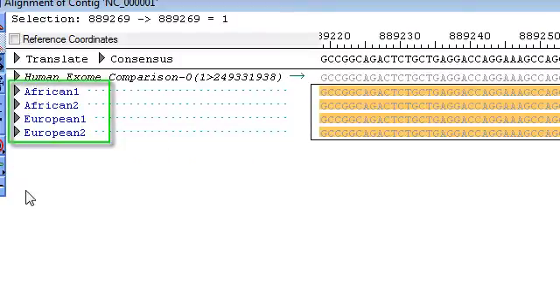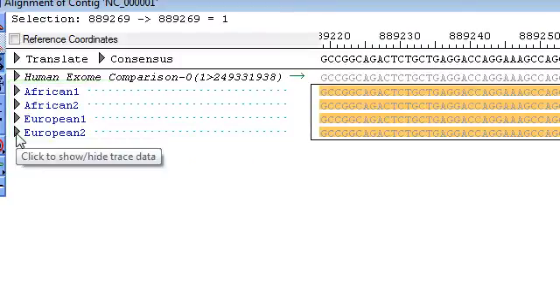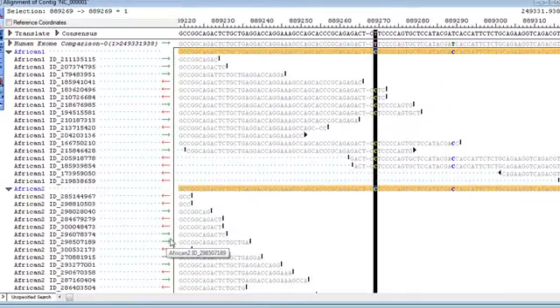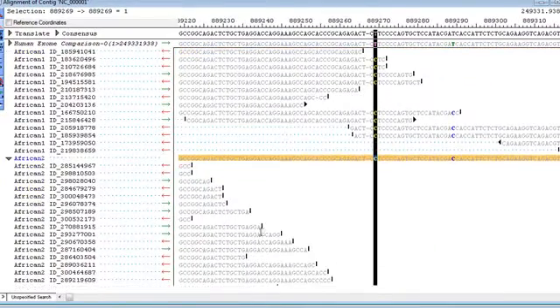Now, as a shortcut, if you hold down the Alt key while you click on one of these triangles, that will expand all of the samples.